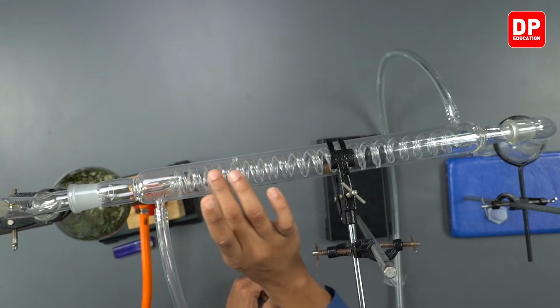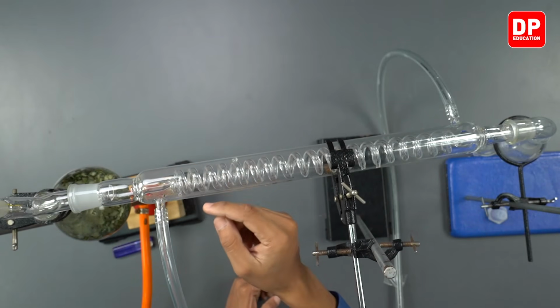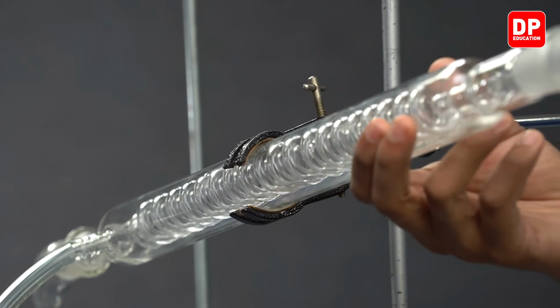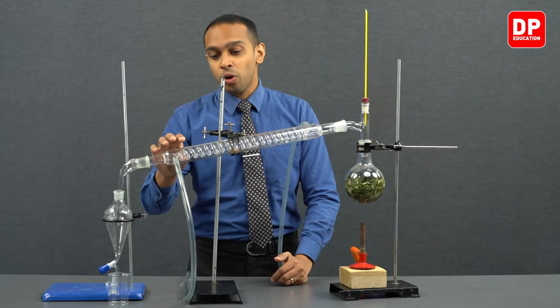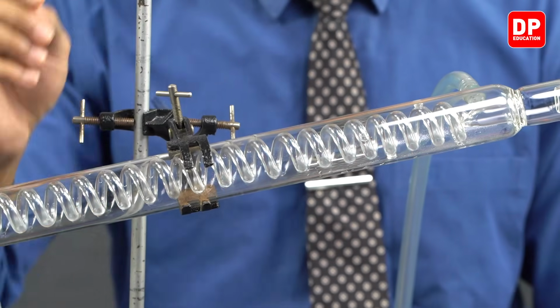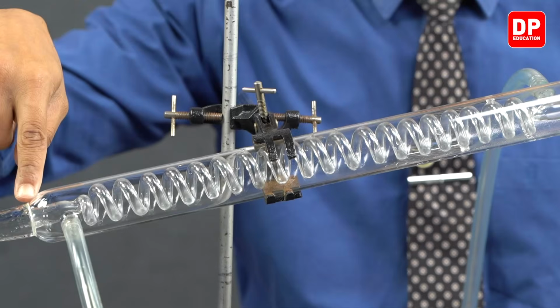And this Graham condenser has a water jacket around this spiraling glass tube. This water jacket that is going to be inside this Graham condenser is going to be cooling down the vapor as it moves from this point to the end of the condenser.